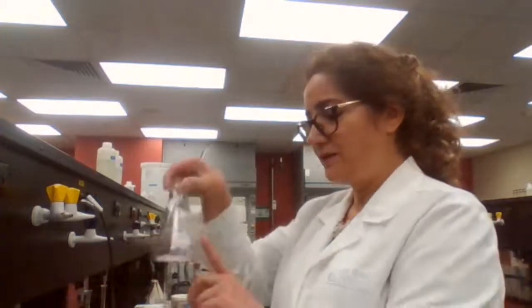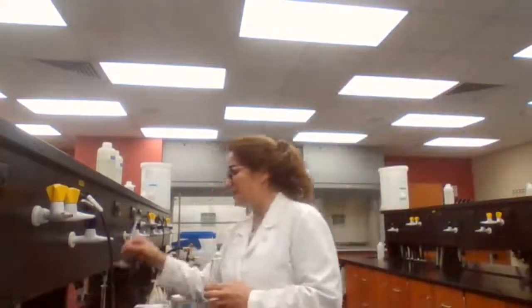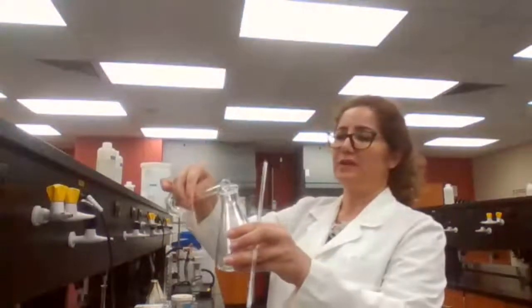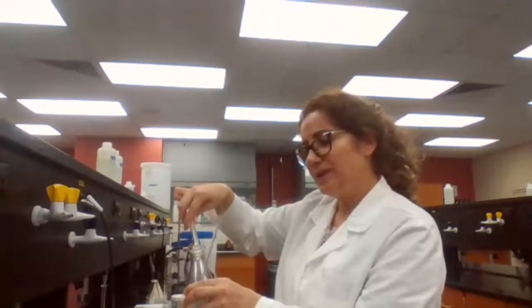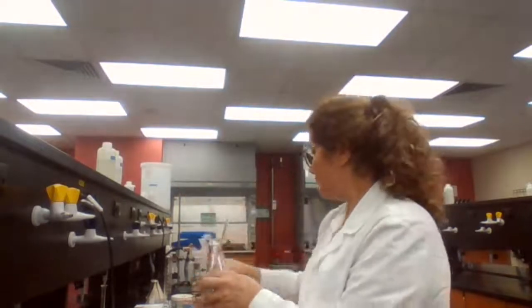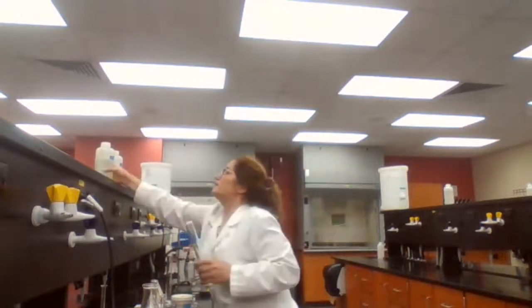In a 250 milliliter flask, I'm going to add 4 milliliters of aniline. I brought the aniline to the station, so I'm going to add the 4 milliliters of the aniline. And what else should I add? What else should I add to the aniline?